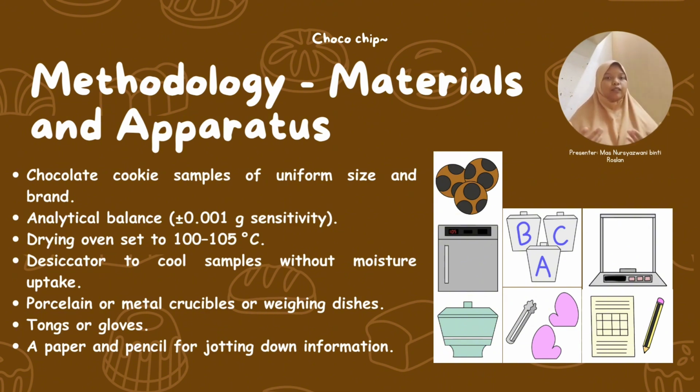The sizes need to be the same so that the results we will obtain will not be too far from each other. They will be more or less almost consistent. They will also need to be from the same brand, since different brands of cookies will most definitely make cookies in different ways. Their moisture contents are not going to be the same. As they have different qualities, so do they have different moisture contents, and this could skew the experiment.